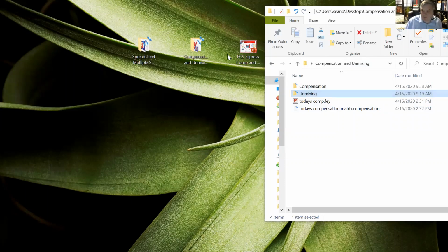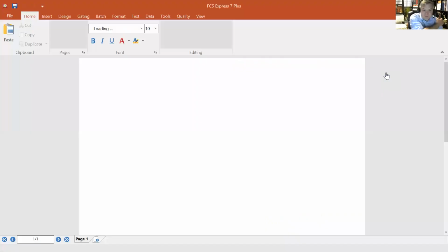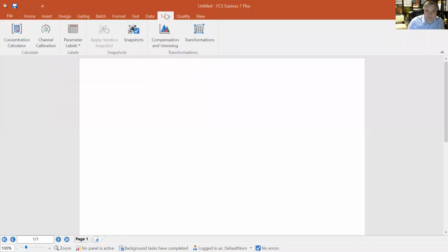All right. Well, while you're waiting for that, Sean, I could just remind people what's really nice when you have that spectral signature plot that pops up is you can use that as a QC tool for yourself, right? So if you want to check your single color controls, that spectrum viewer .scitechbio.com, I believe is the link. I could be wrong, but it's going to be on the slides we send out.